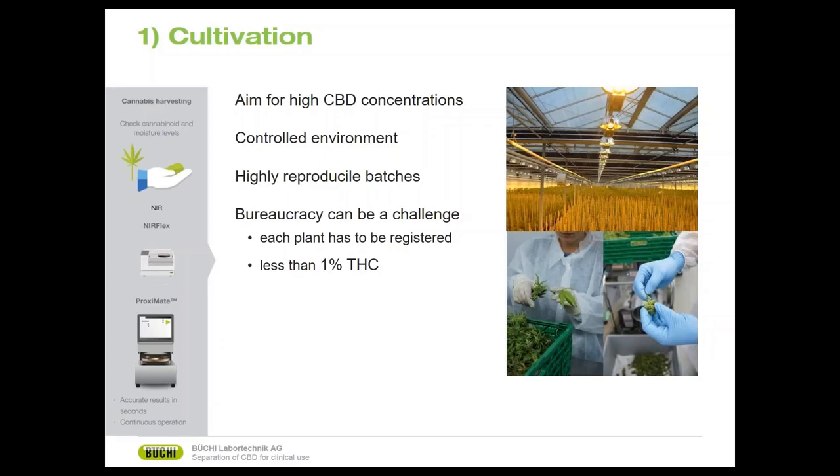In this step, we use the BUCHI NIR called ProxiMate. BUCHI NIR is used to determine the content of the plant. So we use this machine before we start our extraction. So we will know what the yield will be after the extraction because we will know the content of our plants.